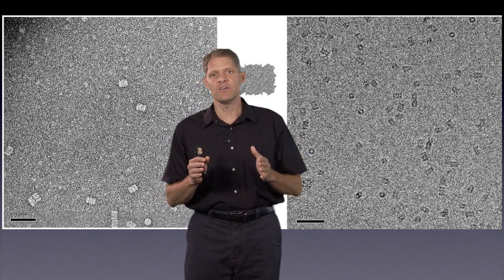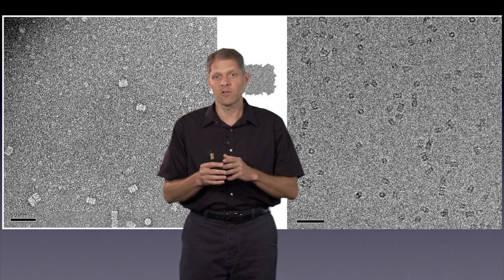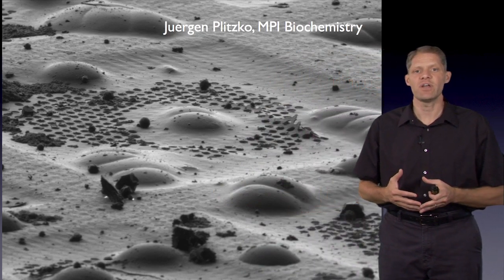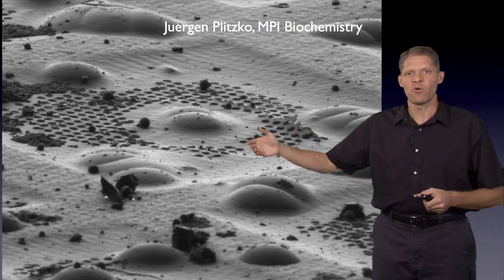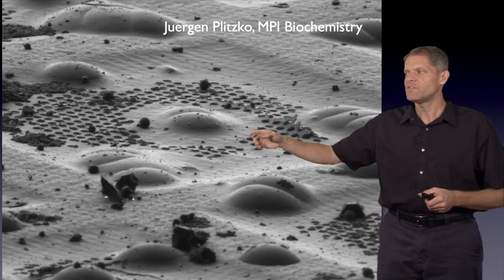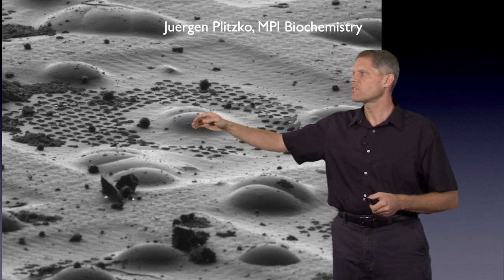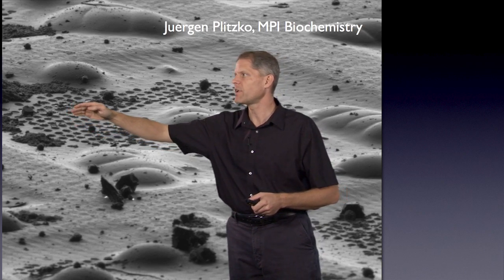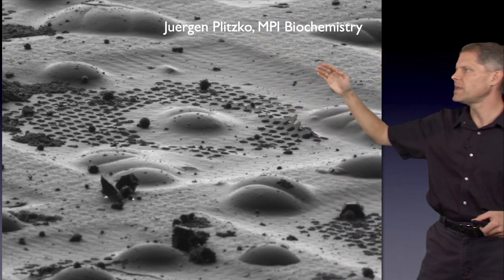Plunge freezing can also be used to give us views of parts of cells or other objects that are larger than 500 nanometers. For instance, even large cells can be grown on the surface of an EM grid. In this image, an SEM image recorded by Jürgen Plitzko, we see a large mammalian cell growing on the surface of the EM grid. You can see the quantifoil holes of the EM grid over here, and the basic structure of the large grid bars of the EM grid here.